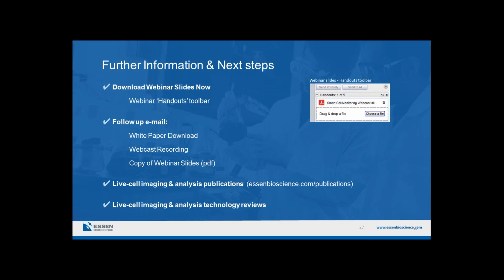The only downside I can think of with that approach is if the killing time course is slow, then potentially you will overwhelm the cell cultures when they reach confluence before you see any killing. But I have to agree with the suggestion, particularly for ADCC, where we know the killing profile can be relatively quick. In this case, the SKOV3 cells are not so precious, in as much as they're an immortalized cell line. You could certainly use a higher cell number to begin with. So yeah, that's a great comment.